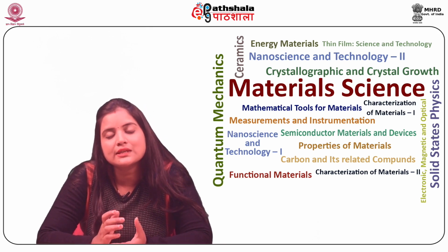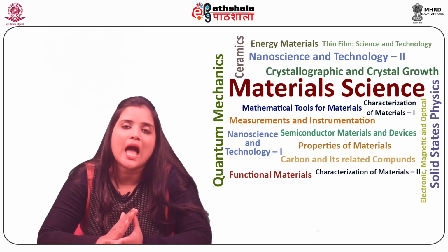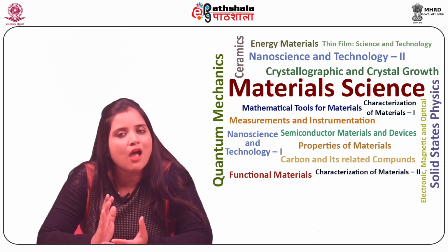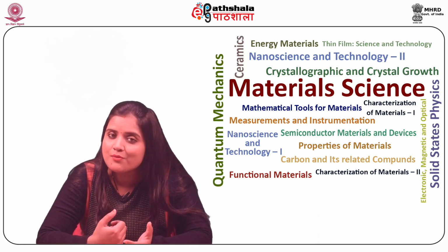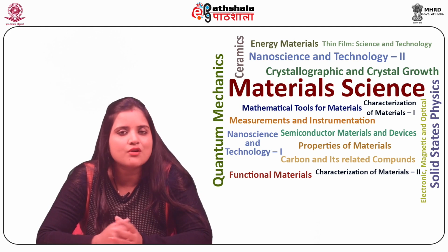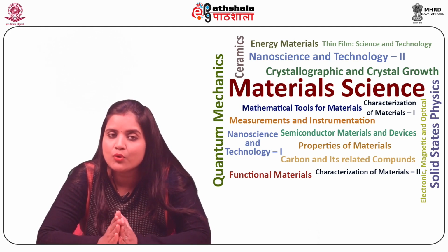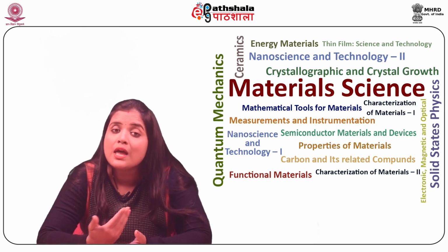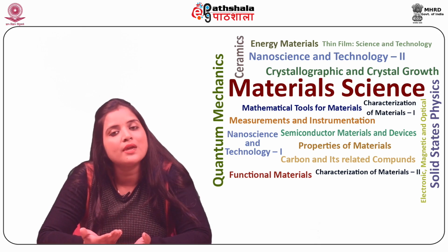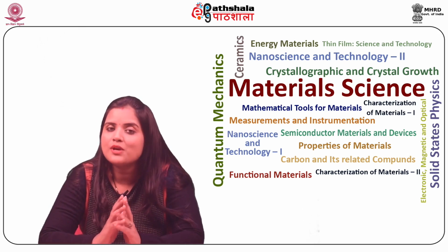We will next discuss atomic force microscopy, which is abbreviated as AFM. Unlike STM, an AFM monitors the forces of attraction and repulsion between the probe and the sample. Atomic force microscopy has the ability to measure force, image, as well as manipulate the sample.